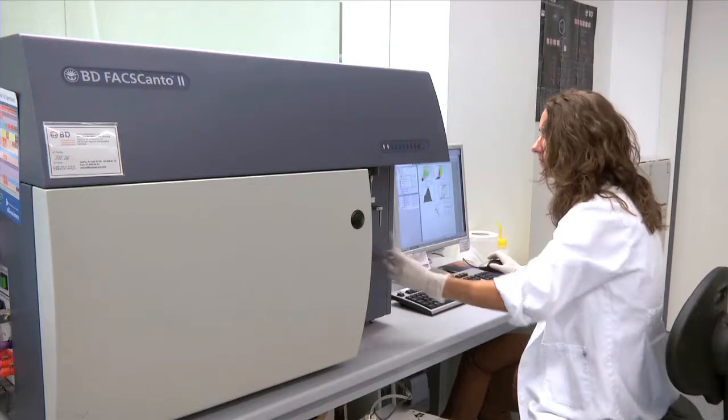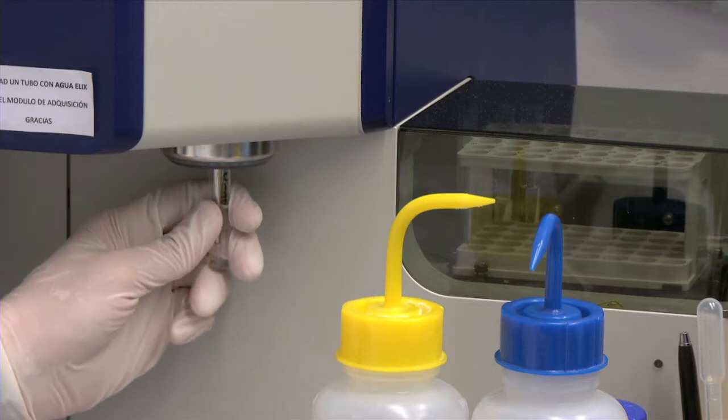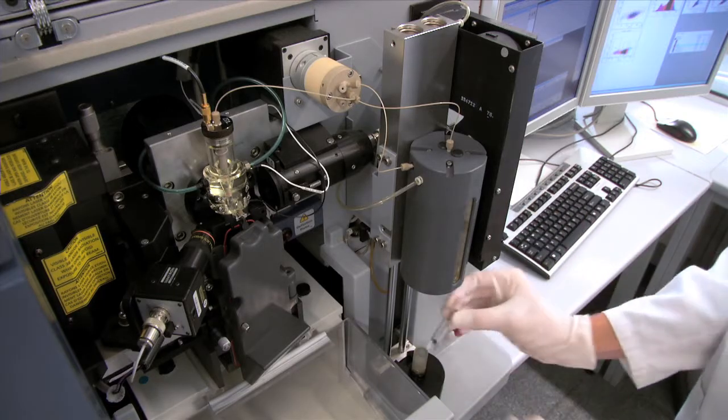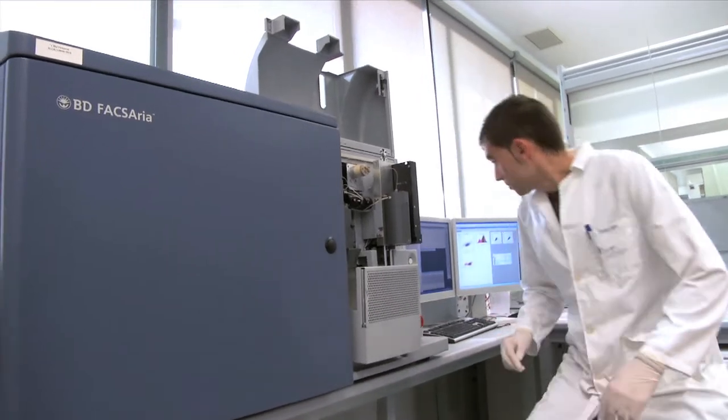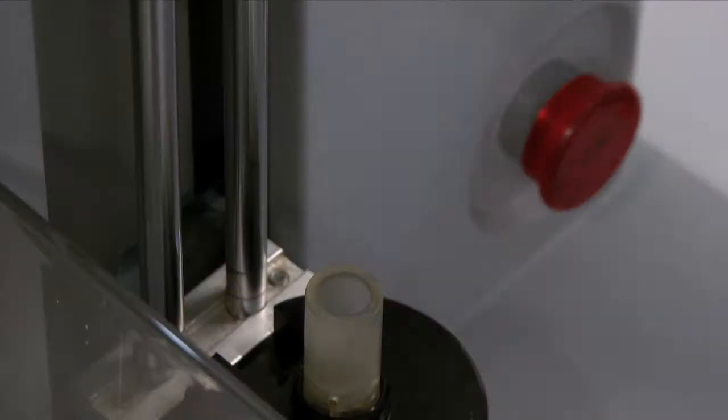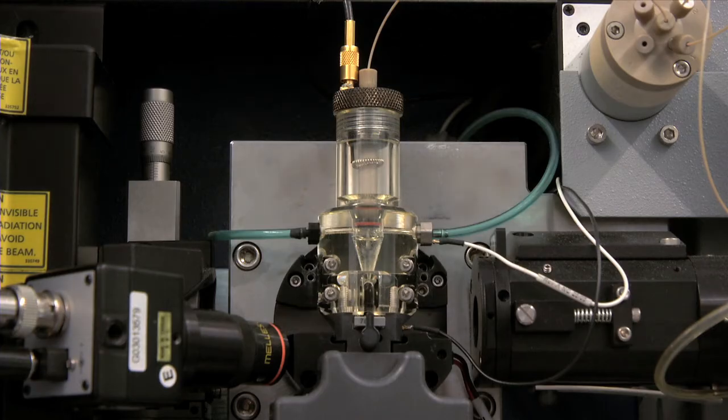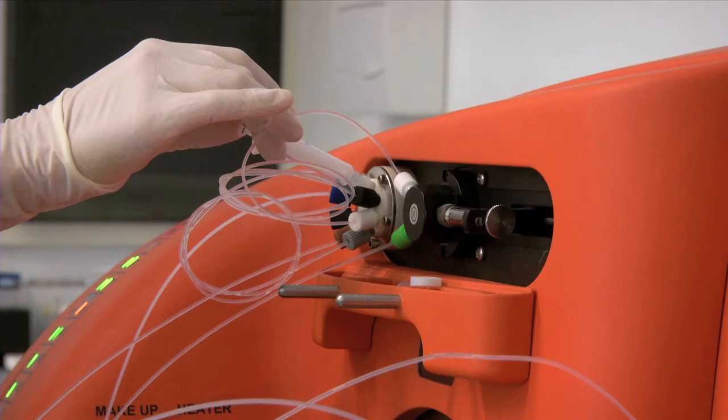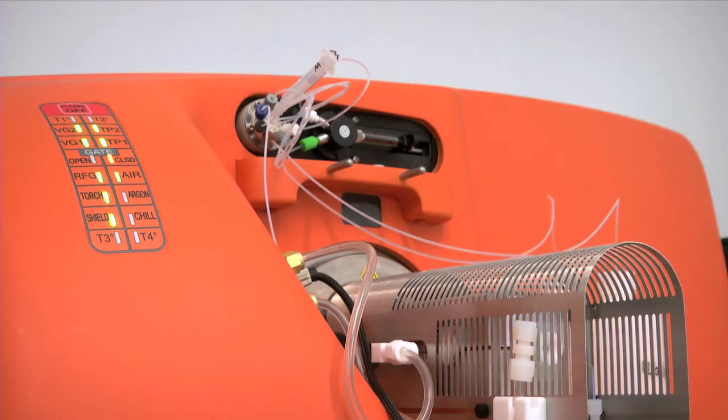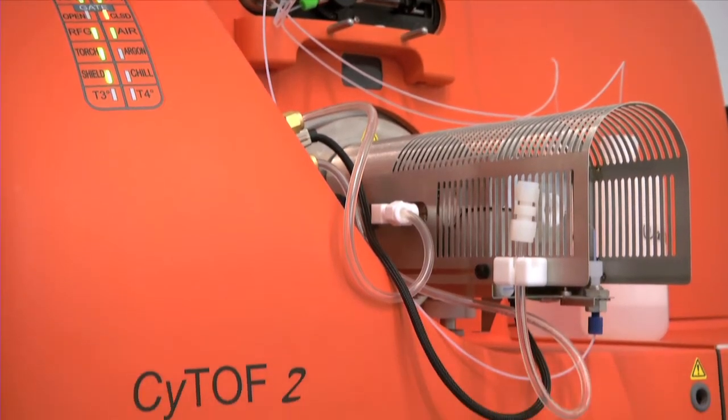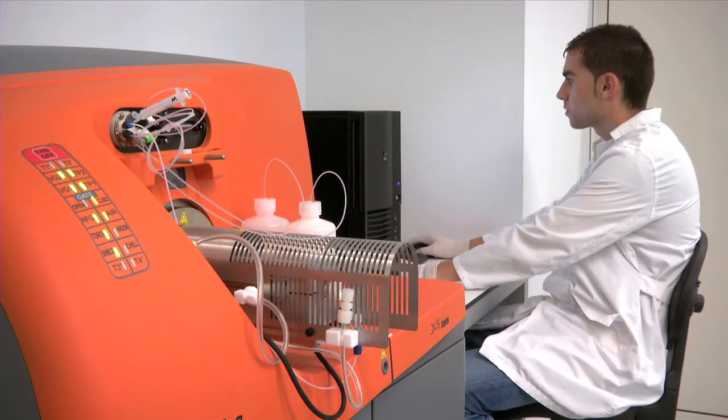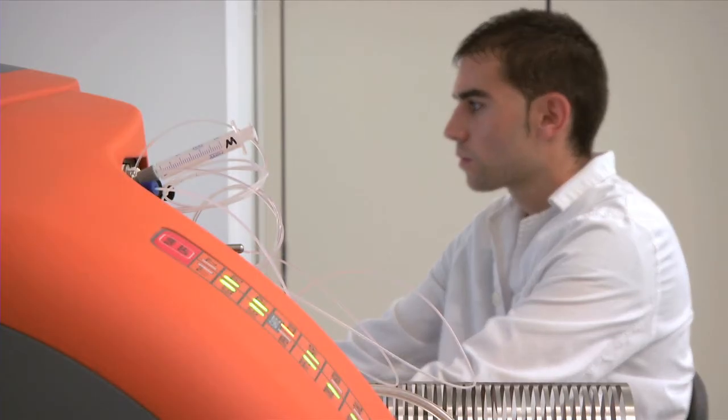In the cytometry and sorter unit, we have three flow cytometers: FACS Canto II, FACS Verse and FACS Aria, the latter with the possibility of separating populations. The unit also has a CyTOF2 mass cytometer, the only cytometer with atomic mass spectrometry, that allows the multiparametric analysis of more than 30 biomarkers at an individual level.